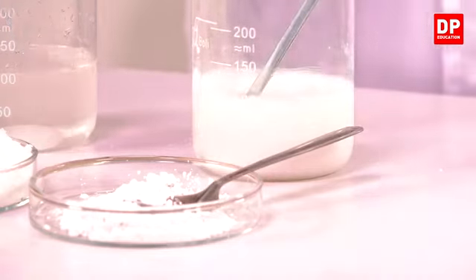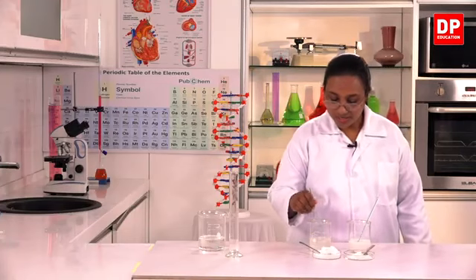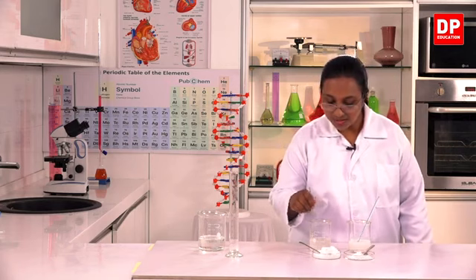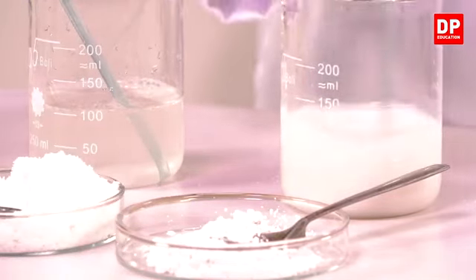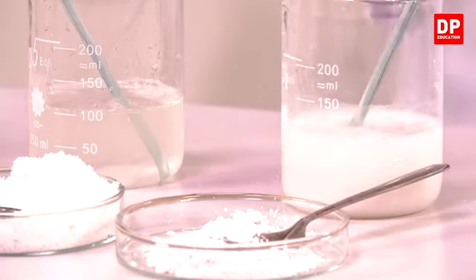But you can see a difference in the two solutions. The sodium chloride solution is clear. It's a transparent solution, whereas here you can see the calcium hydroxide is not transparent. It's a milky color solution.